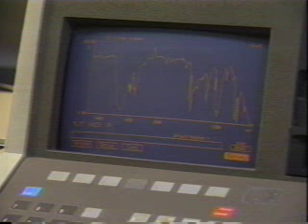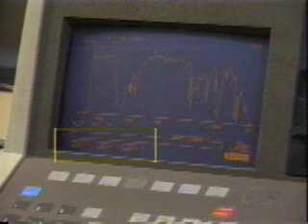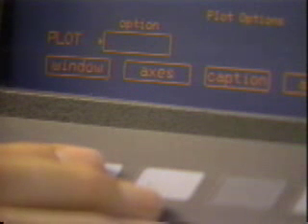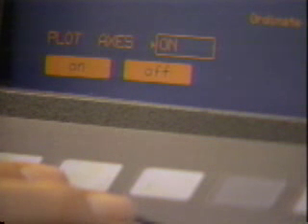For instance, beginning with the initial screen on the FTIR, the three soft keys on the left — method, setup, and copy — currently allow you to change various parameters of the instrument or to copy spectra. Press the soft key below the word 'setup' and the following screen appears. Now press the soft key below the word 'plot' and you obtain a menu which allows you to change plot parameters. Press the soft key below 'axis' and you have the option to turn the plotted axis on or off. Press the soft key below 'on,' then press 'exit' to return to the main menu. If there is no word on the screen above a soft key, that soft key has no function at that particular time, and if you press it, it will beep at you.